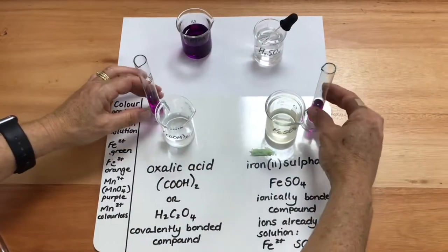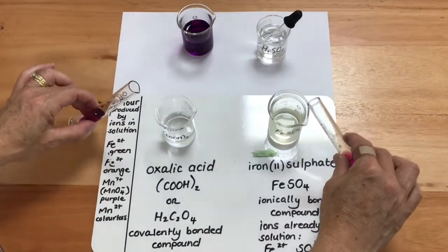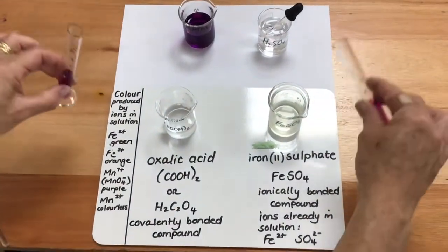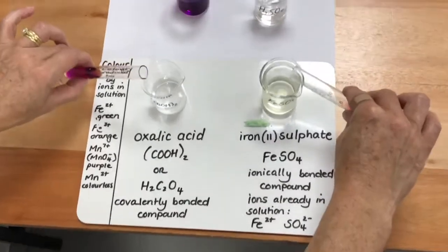I am now going to simultaneously add these two and we are going to see which solution in my beakers is going to turn the solution colorless the fastest.